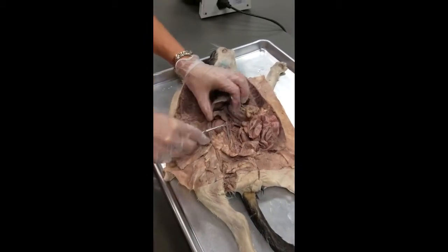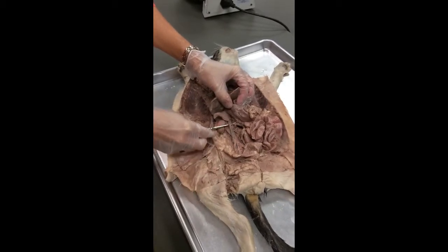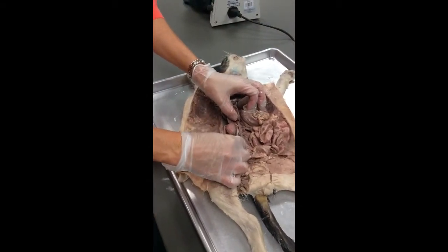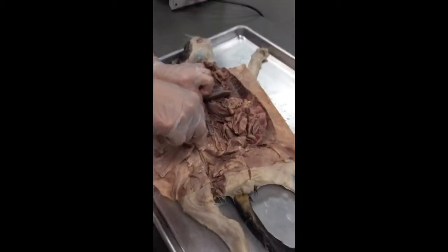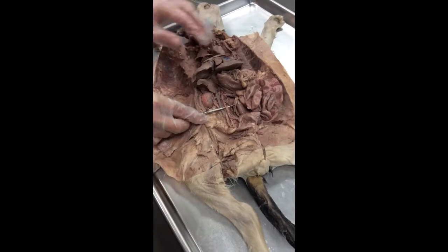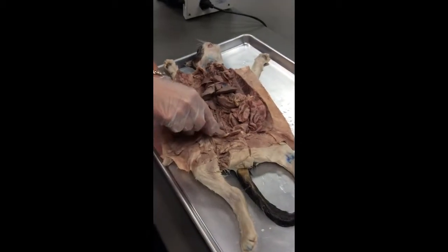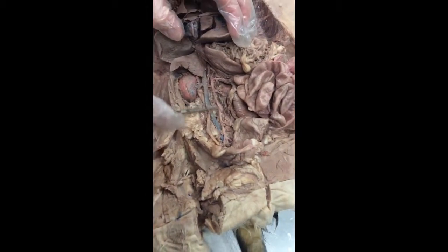And now the vessels is what you did a really good job on. So what is this? Inferior vena cava. Renal artery. But it's blue. Vein. Renal vein. And what is this? That is one flat cat. Like really. The abdominal aorta. Abdominal aorta. Oh, abdominal. Because when it comes down here, it'll branch into your iliacs. Then we need to know that one. Okay. So abdominal aorta.